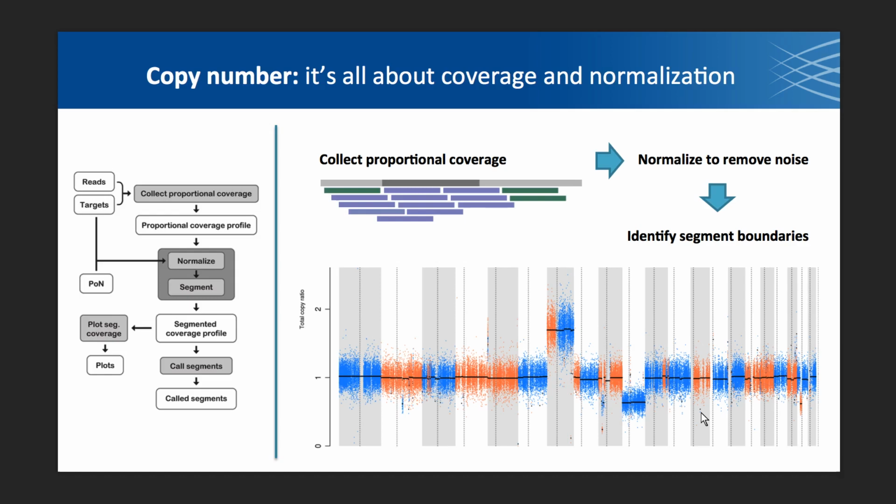But we know that there are many attributes of sequencing that are going to introduce bias. Like we know that areas of the genome that are rich in GC content tend to be copied slower because the polymerase is slower, and so they're going to see a little bit less coverage for that reason. If you're working in an exome context, and all of a sudden you have the bias of doing the bait capture for each of the coding regions, that's going to introduce bias in your coverage.